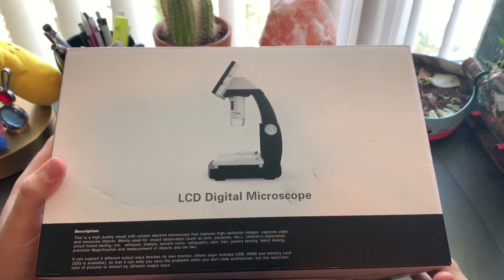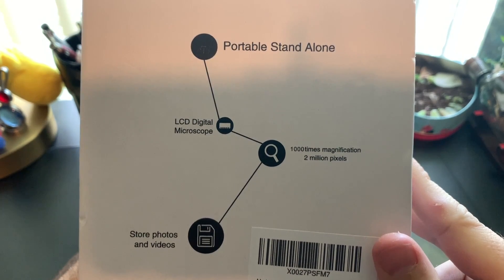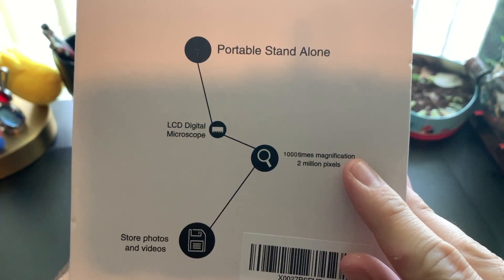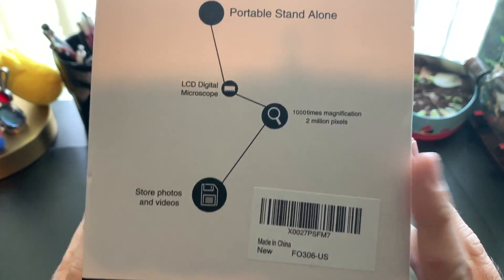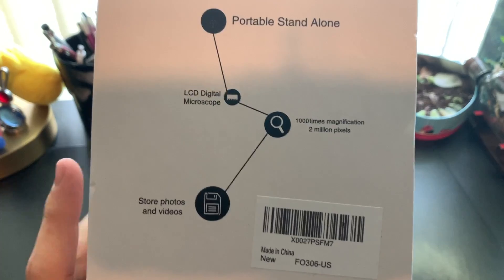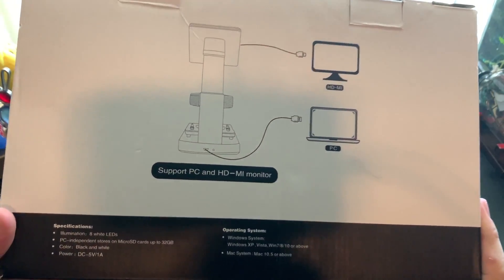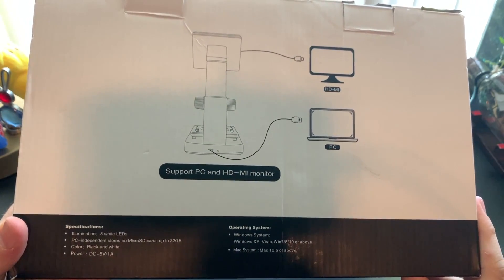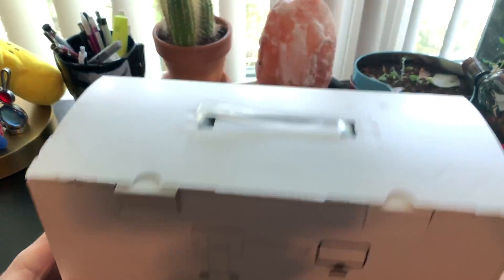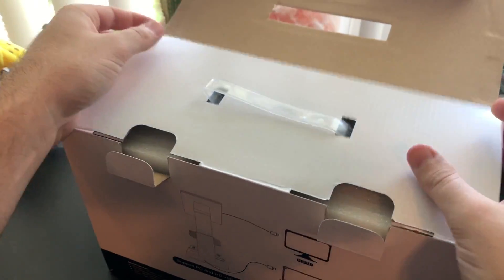Here it is — you can see the front of the box right here. Nothing too special, doesn't really say a brand name or anything on it. Going to the side, you can see some of the details: 1000 times magnification, two million pixels, two megapixels, LCD digital microscope, stores photos and videos. You can put a micro SD card in here, and down below you can see the operating systems, eight white LEDs, and micro SD card support up to 32 gigabytes.